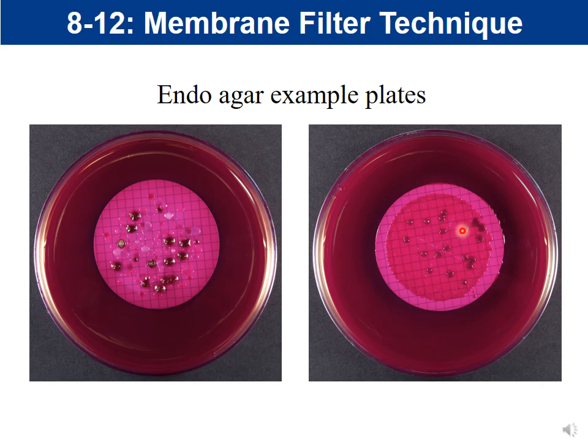And some of the bacteria are non-coliforms. They're light pink. If I look at the one on the right, notice that the concentration of bacteria was so high. See how you see this dark ring here? That means that this whole area is covered in bacteria. And there's no really way to quantitate your number of colonies if it looks like this.